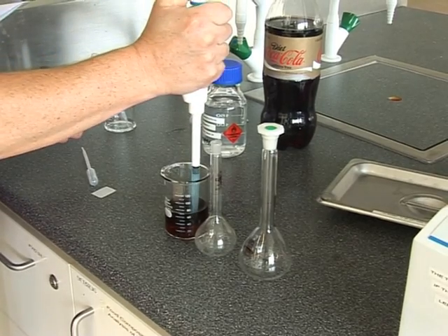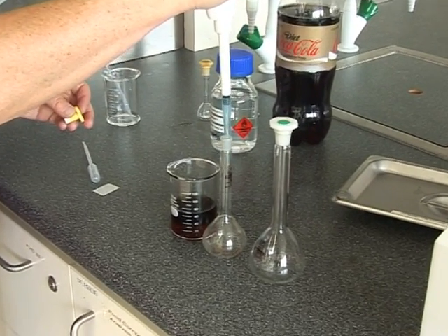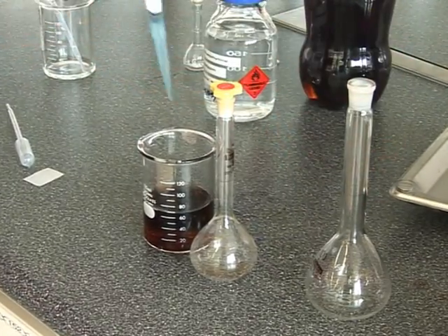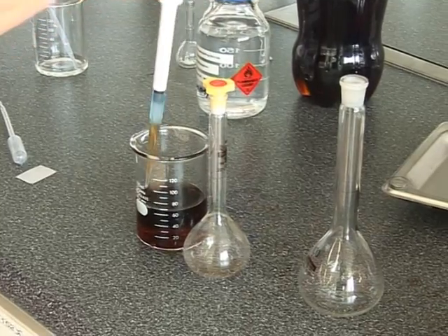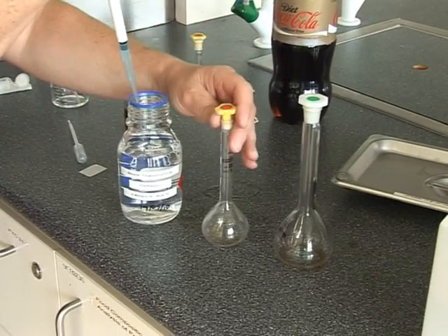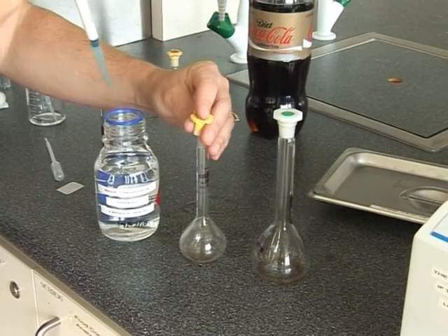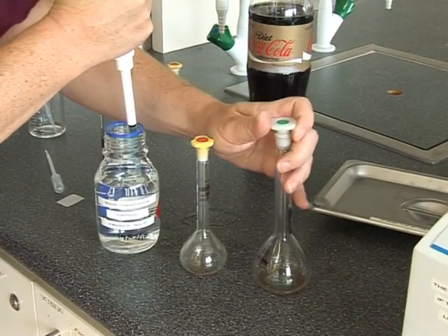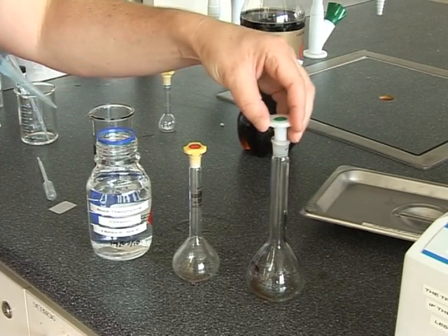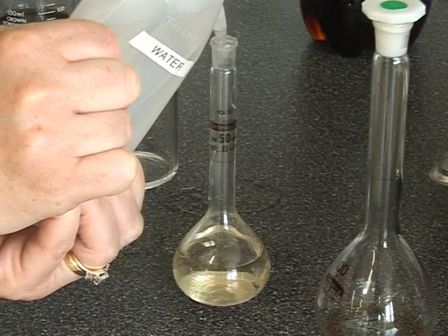You'll need to make a 1 in 50 and a 1 in 100 dilution of each of the soft drinks. Dispense 1 milliliter of the soft drink into a 50 milliliter volumetric flask and another 1 milliliter into a 100 milliliter volumetric flask. The samples also require 20 parts per million theophylline in each flask to act as an internal standard. Calculate the amount of the initial theophylline stock solution required to achieve this concentration in the appropriate volumetric flasks. Make the flasks up to the mark using distilled water.